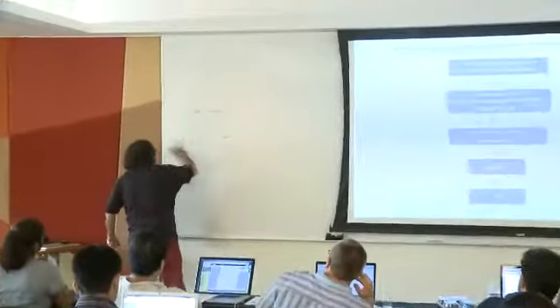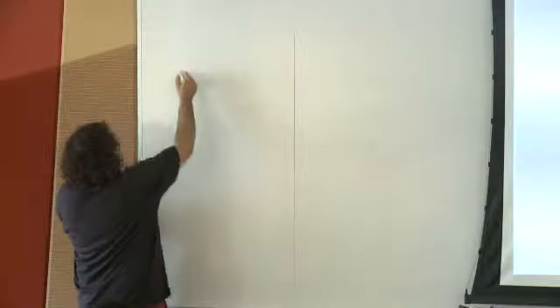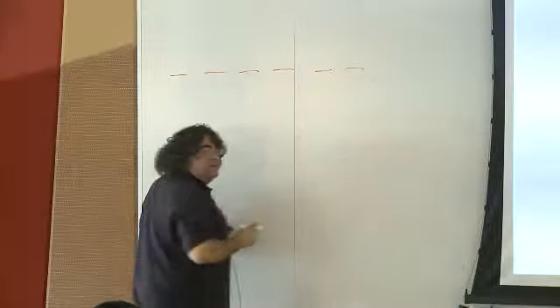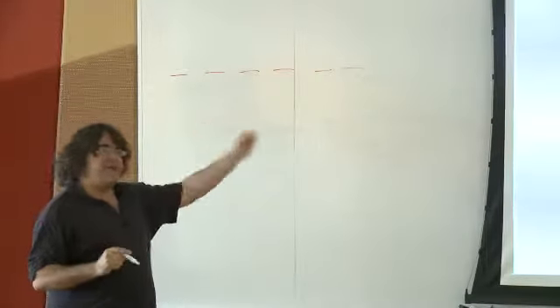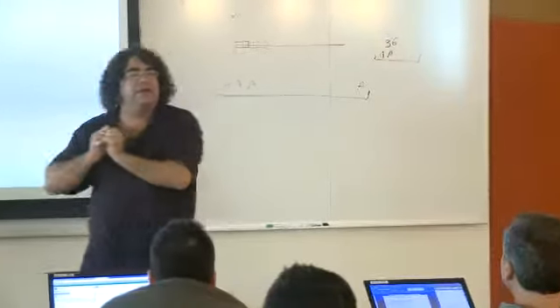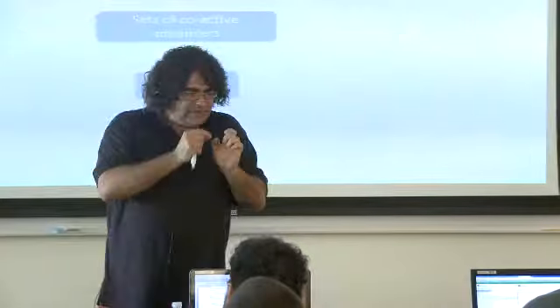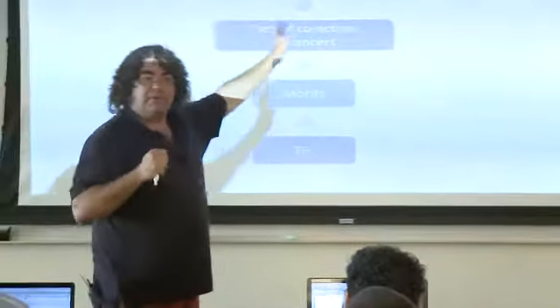So the question was about motif. I told you we find bits of DNA that seem to have certain patterns of histone modifications associated with them. So I found a pattern and I call that an active enhancer. But that's just a name. It's really that in this part of the genome, I find that certain events happen that I measure with these maps.